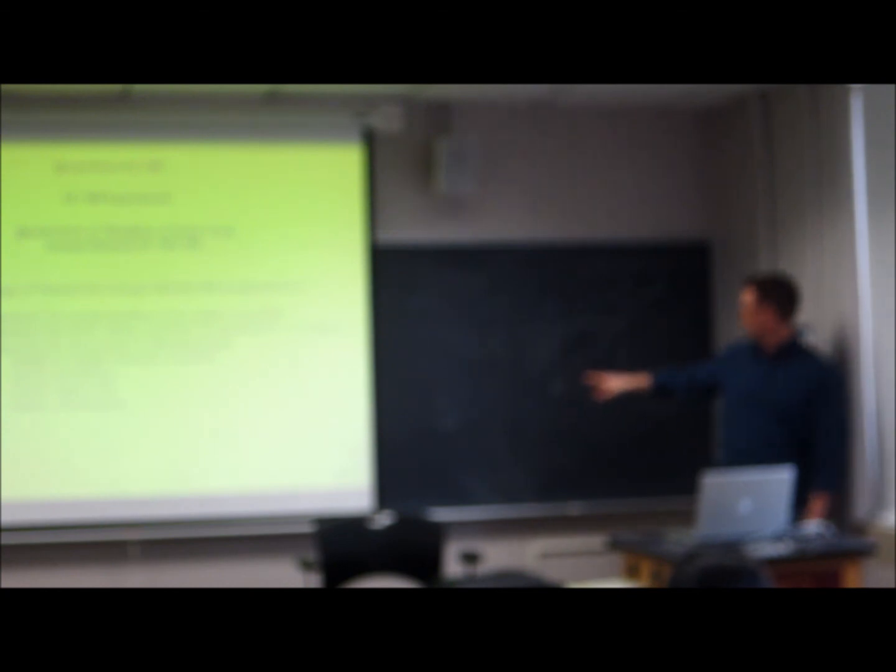The other thing you want when you add your internal standard when you're doing quantitation is to add it at a level so that its response is similar to the response of your analyte in whatever samples you're analyzing. If you add internal standard and it's 1,000-fold more concentrated than your analyte of interest, you're going to get suppression, severe suppression by your internal standard. Things are going to get ugly. So you want, optimally, to add internal standard at about the midway point on your standard curve.